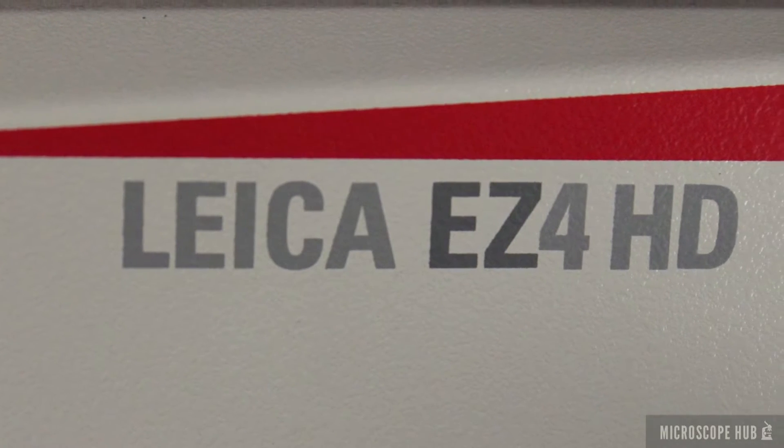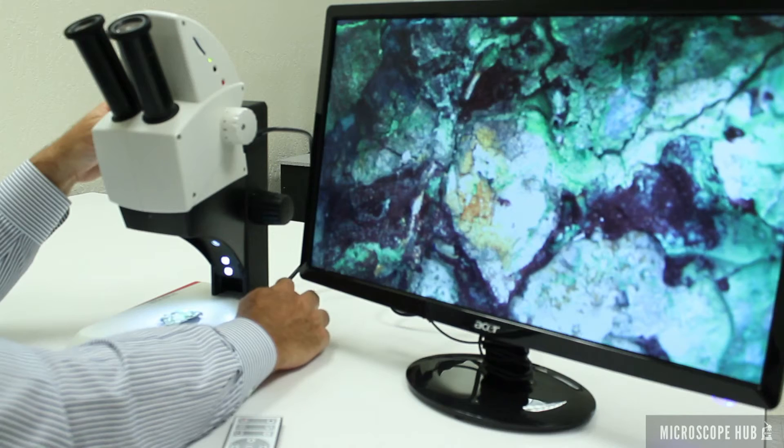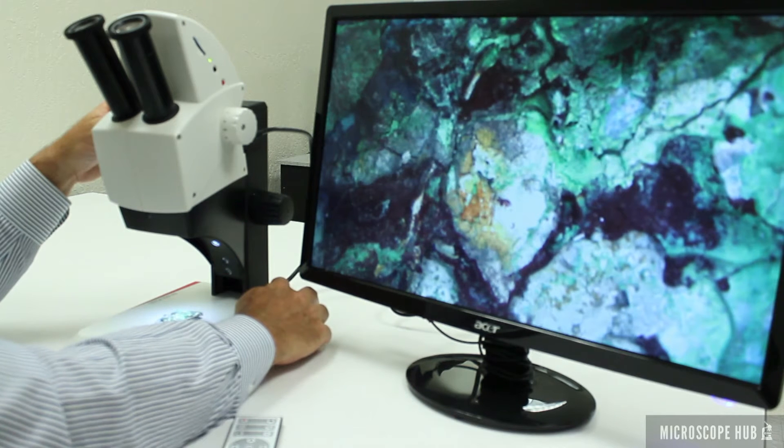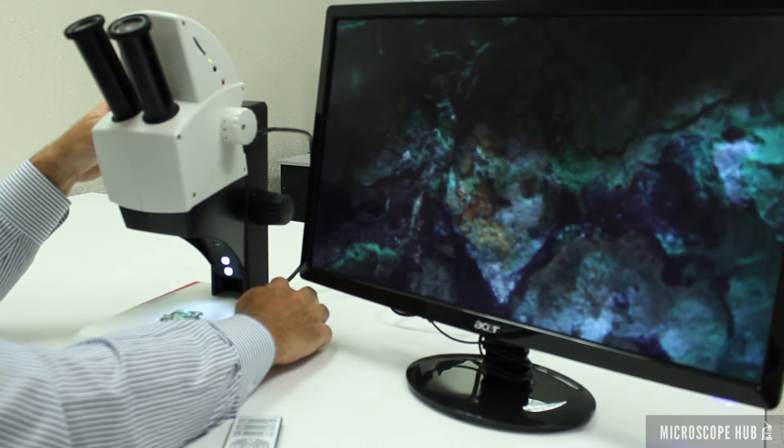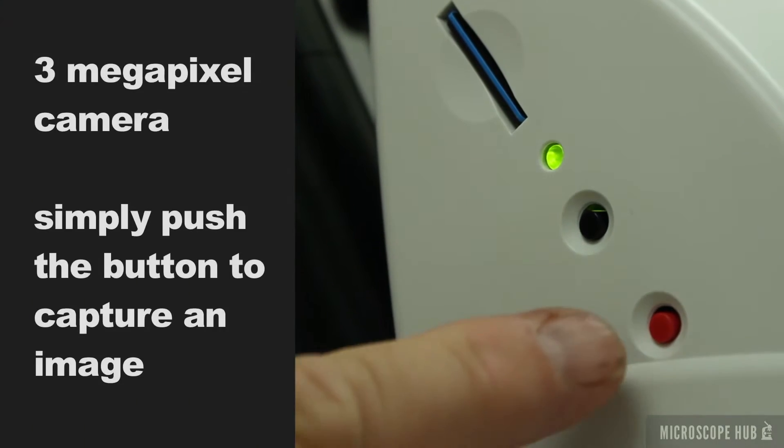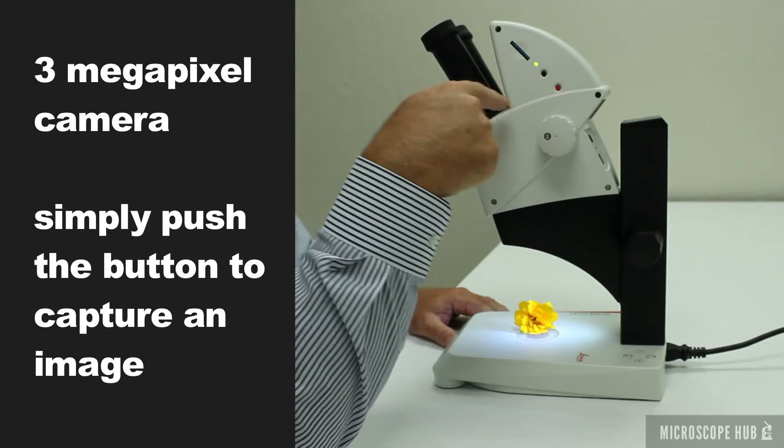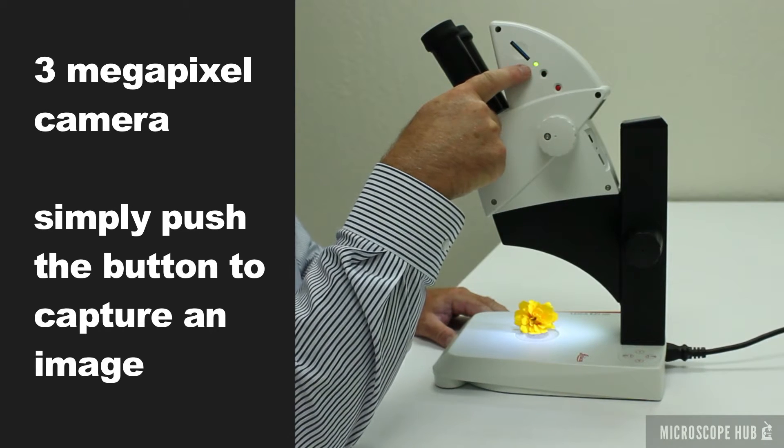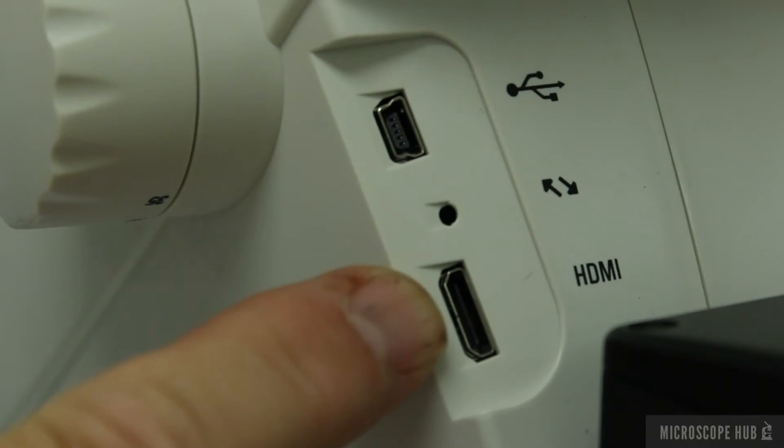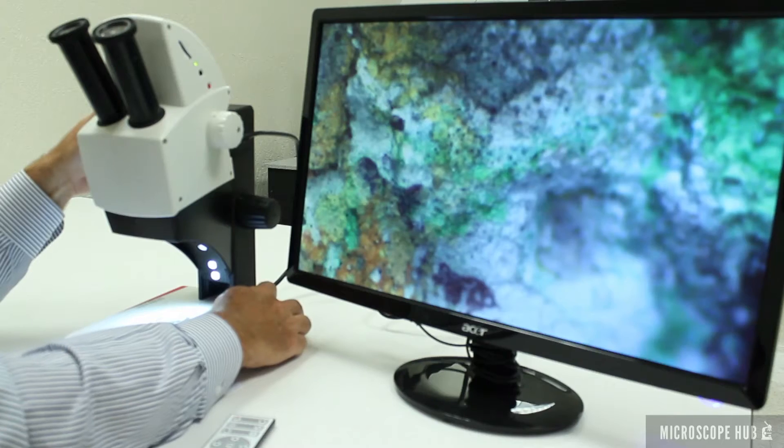The EZ4 HD Educational Stereo Microscope offers the best modern technology for college and high school science programs. It comes with a built-in digital camera for taking pictures. It can store images onto an SD card or connect to an HD monitor or computer for a live view.